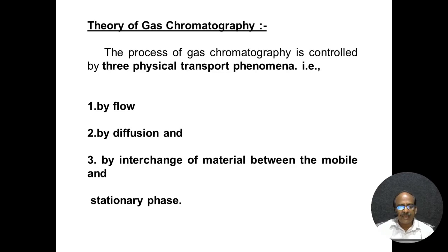What is the theory of gas chromatography? Is there any theoretical process for gas chromatography? Yes, there is. It is controlled by three physical transport phenomena: by flow, by diffusion, and by interchange of the material between the mobile and the stationary phase.